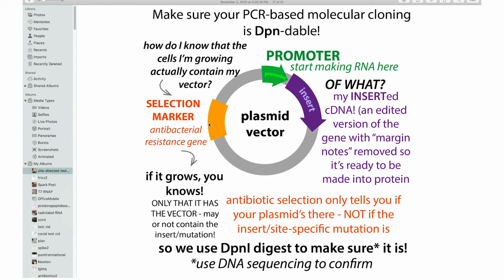Typically at that point, instead of making the protein, you first want them to just make lots of copies of this plasmid that you put in there, and then you can check whether it was actually the right sequence using an analytical digest, or by sending it for sequencing to make sure the spelling's all right.